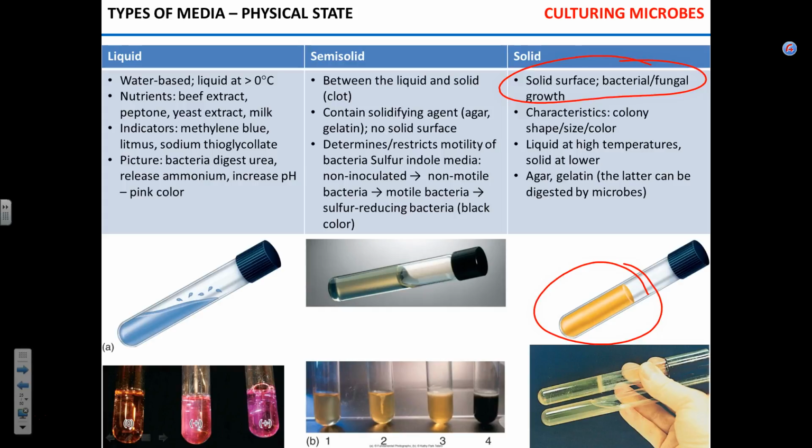Actually, size sometimes. If you tweak a microbe just a little bit, if it mutates, it can form the same shape, same color, but smaller colonies. So it doesn't spread that much. Okay?